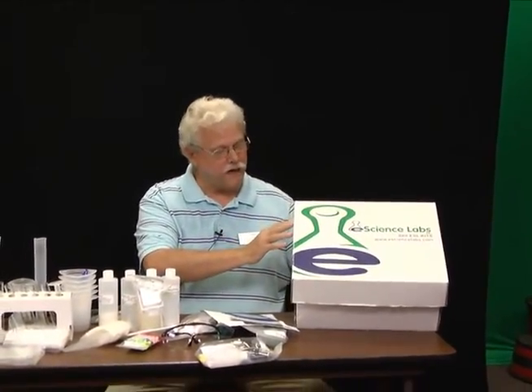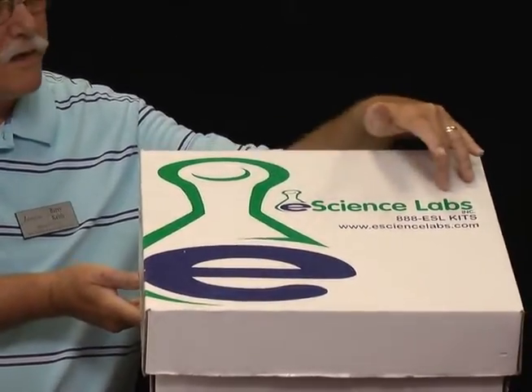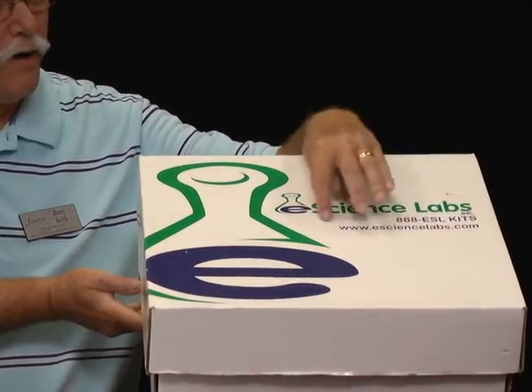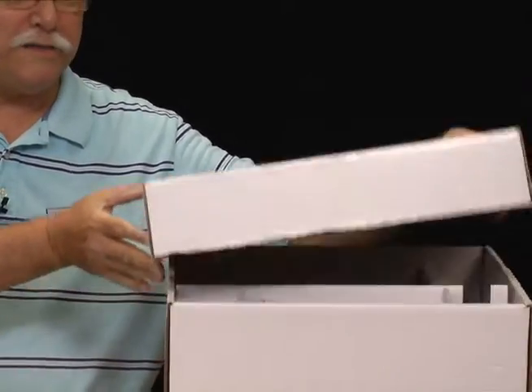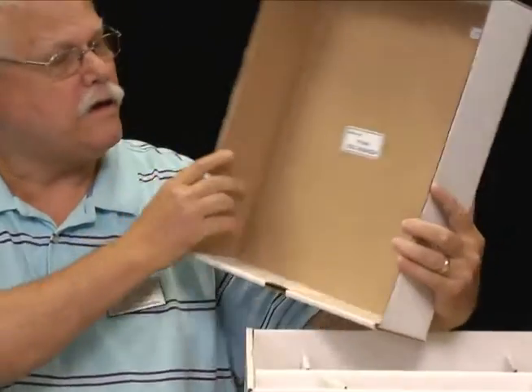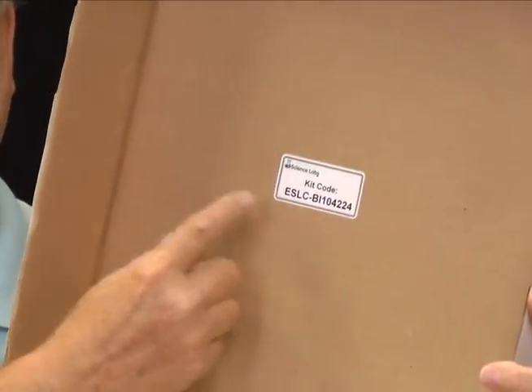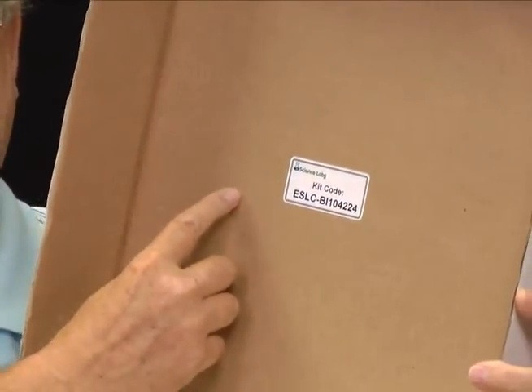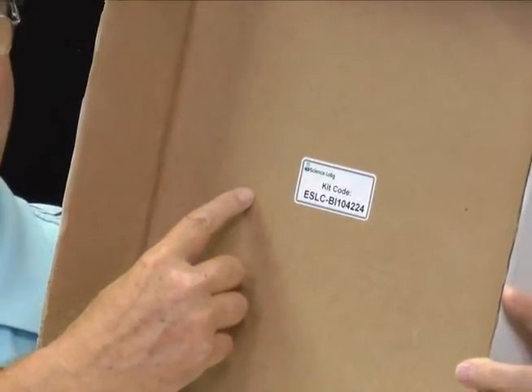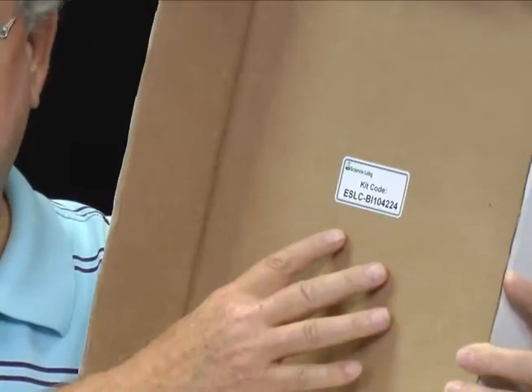Here's the box, and on the front of the box there is the title, the company name, eScience, and there's a phone number and also the website. When you open the box, and this is extremely important, inside the top is the kit code. Any of the online activities that we have, after you register for your class, you will register with the eScience company and use this kit code to do so. So don't throw the box, don't throw the top away.